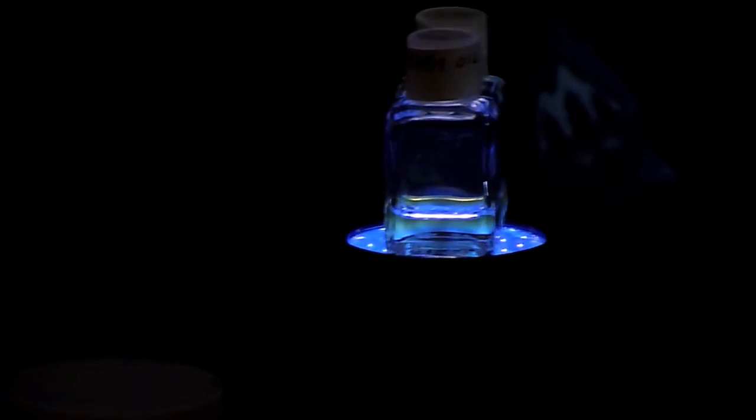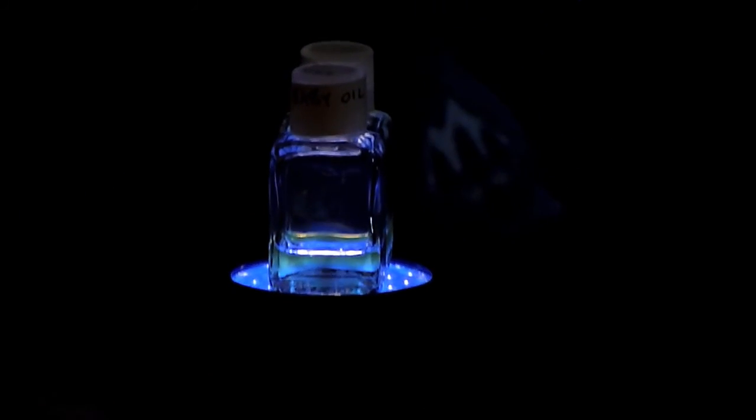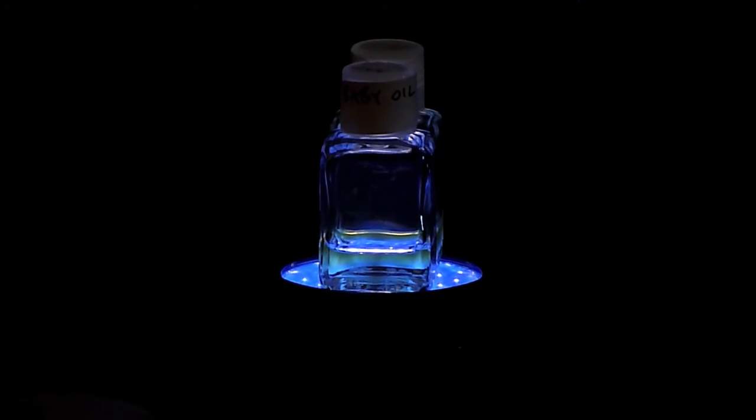But then you wonder, if there's plant material, will the chlorophyll in even dead plant material glow? Probably not, but we want to make sure, because you look at olive oil, and in the dark you can see two different distinct colors. Are they the same colors with the fluorescent? That's fluorescence, right? Yeah, that's fluorescence. So it's the same orangey color that's fluorescing from the laser.